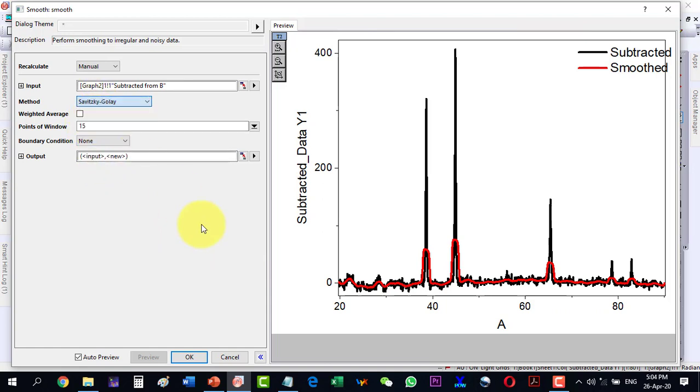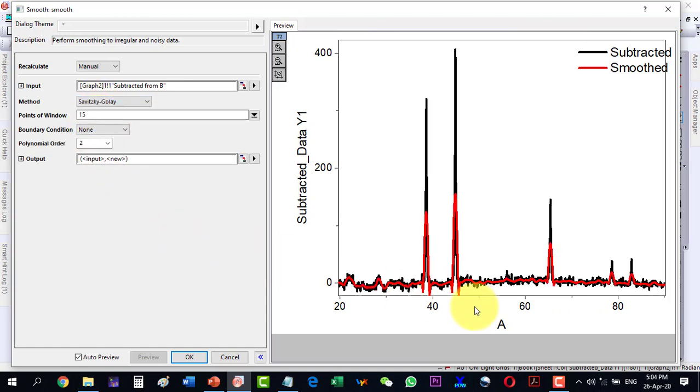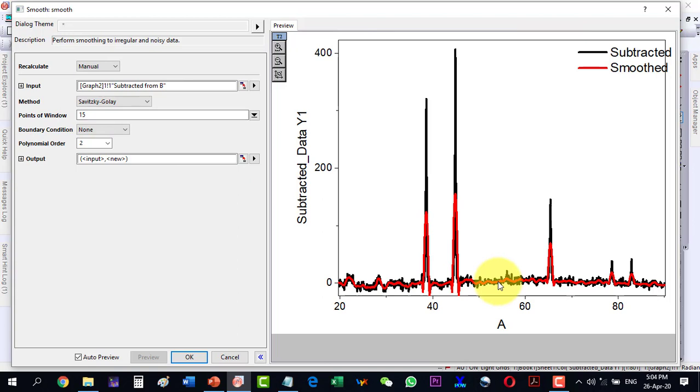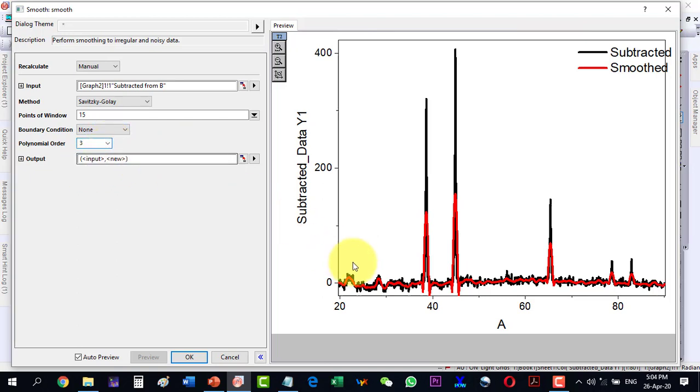And now this is showing me that the XRD plot has been smoothened. And if I change the polynomial order, I will see no prominent effect here. So I will keep this one at 2 and I click OK.